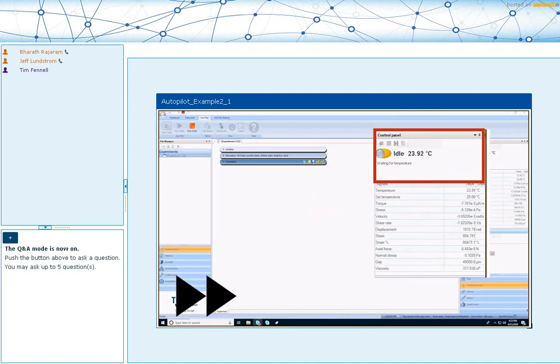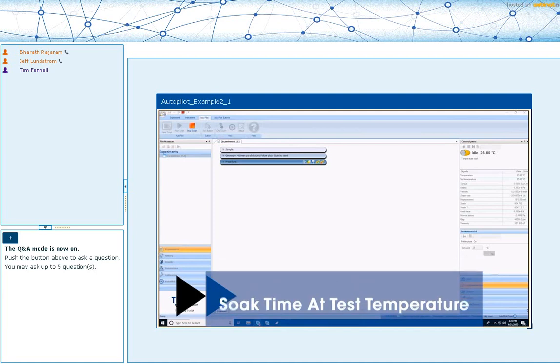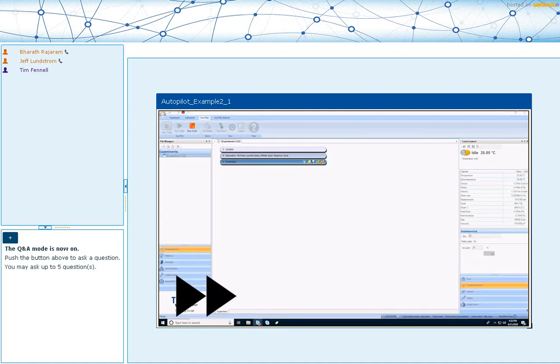Now we'll speed up. That particular folder had about 80 different files, and all the user had to do is hit start and select the folder. From that point on, it is truly in autopilot mode, where it's opening each of these files, doing the analysis, sending it to the control chart and populating that without any additional inputs from the user. The output has the data from the minimum, maximum, and the file that matches most closely to the average. And so these are saved as individual files.